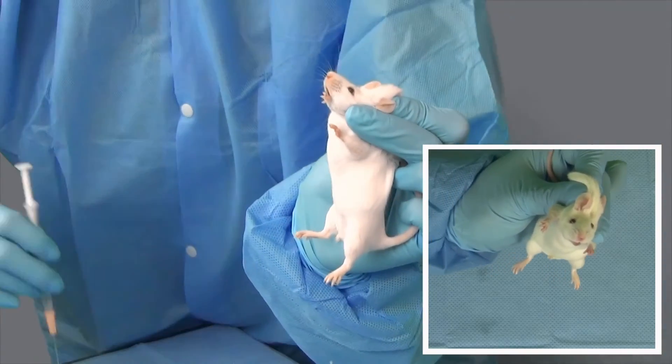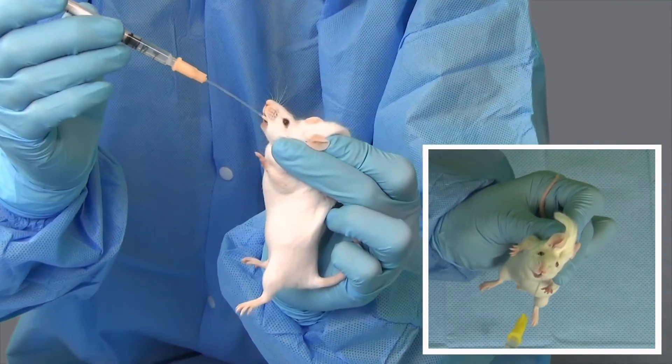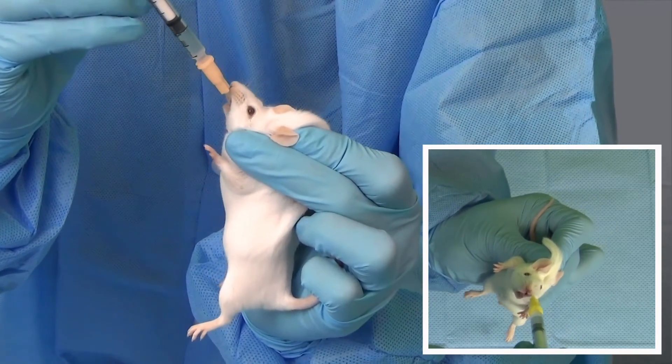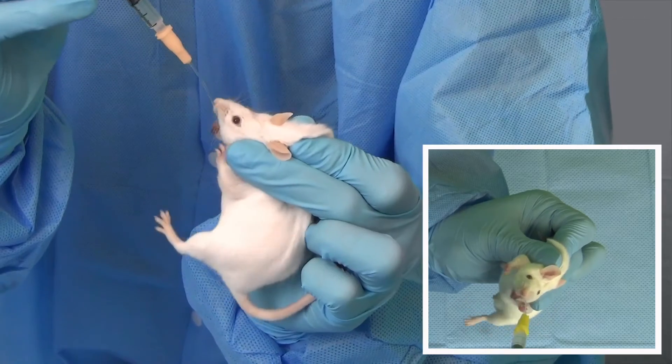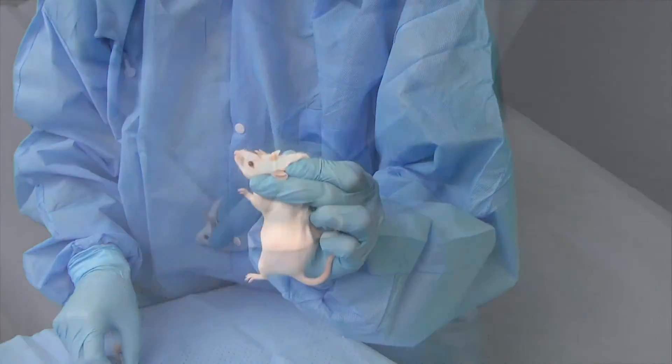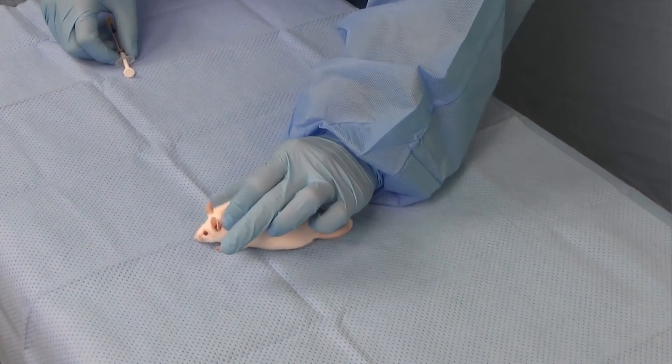Compound administration should be controlled but swift, as taking too much time could result in animal distress, but instilling compounds too quickly can result in reflux. The entire volume of compound should be administered before the feeding tube is withdrawn.